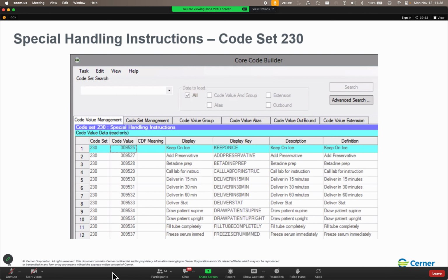And then right there on the specimen label, it says the routing. Hey, this is going to baseline West chemistry. This is going to model experience chemistry. So some sites have done that, and they find it to be useful. I am not saying that you all should do it. I'm just saying it's an option. So these are our collection classes and how to associate them with service resources. Any questions on collection classes?